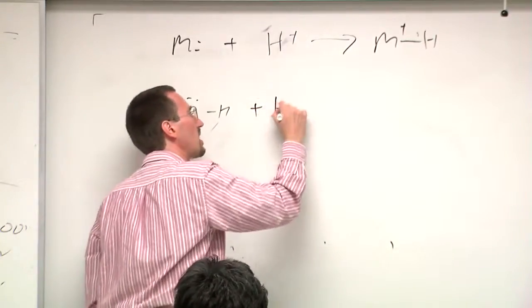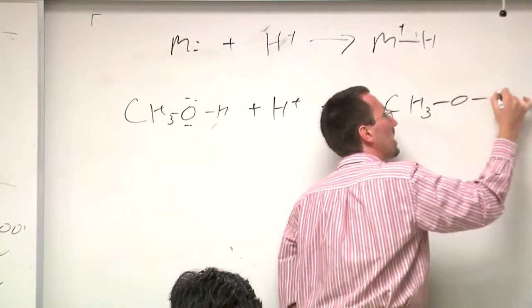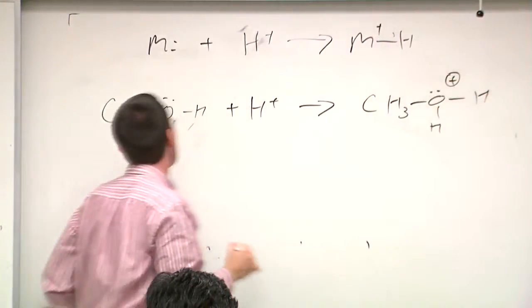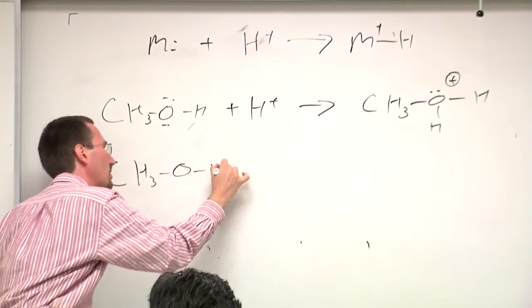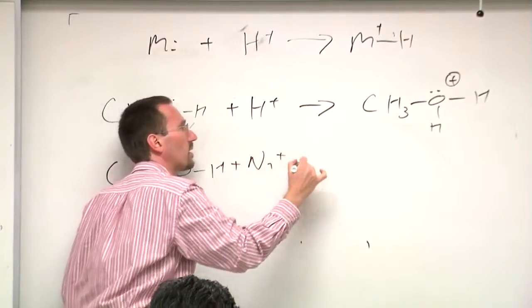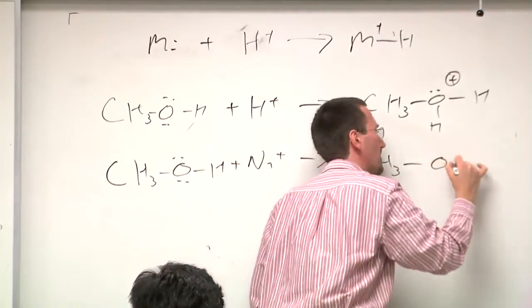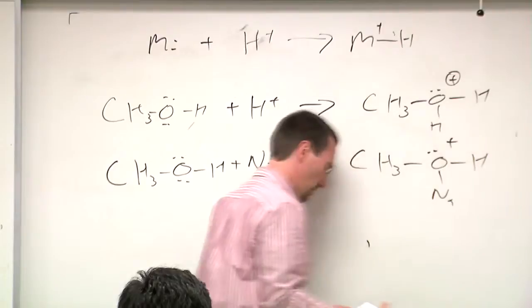If you put a proton on methanol, as I indicated before when I talked about diethyl ether, you will end up with protonated methanol. You have sodium from glass everywhere. And so if you put a sodium on in your soft ionization, for example, in LSI mass spec, you'll end up with a sodium on your molecule.